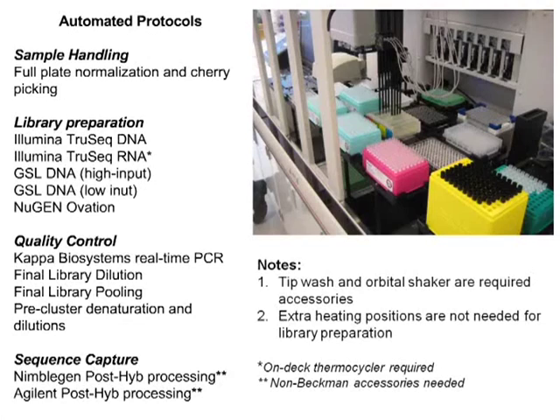So I should emphasize that for the purpose of today's talk, I'll be focusing entirely on Illumina-based sequencing, although we do have some methodologies for Ion Torrent and actually a very limited number of methodologies for the Life Technologies SOLiD platform. But for the remainder of today, I'll be focusing on these automation schemes specific to Illumina sequencing. If anyone has questions, feel free to contact me for anything in addition to what we're presenting today.